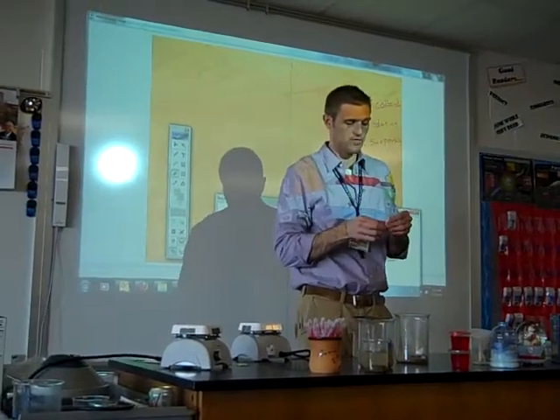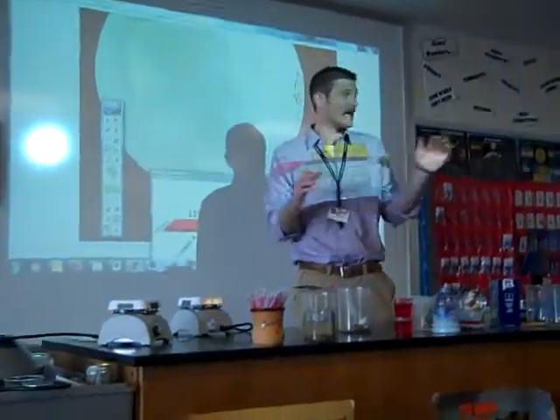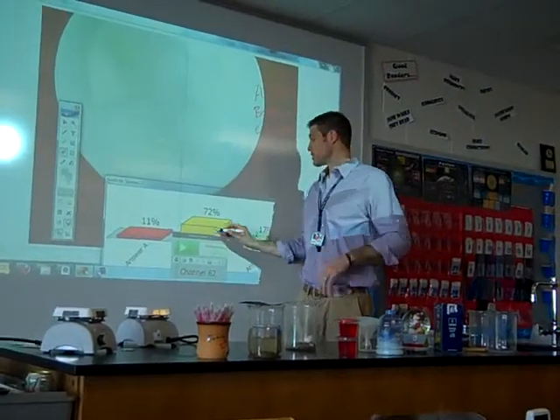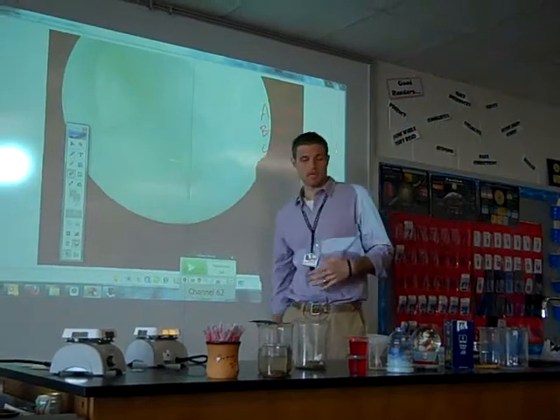Let's try the filter. So it's going through the filter. It did not scatter light. It looked like one substance. So what would that make it? Everybody? Solution. Because solutions do all of those things.